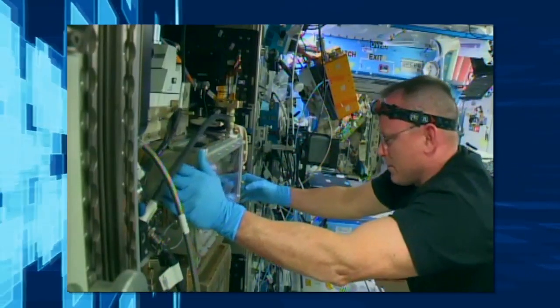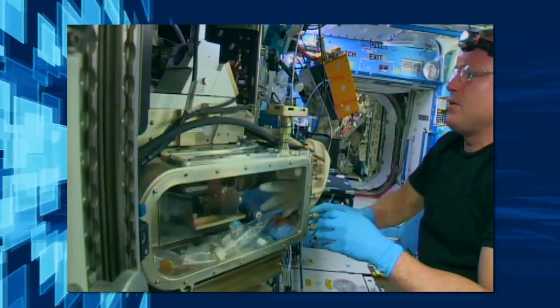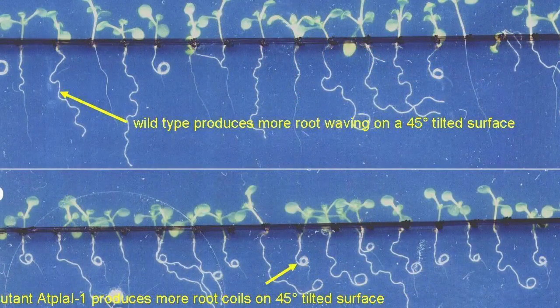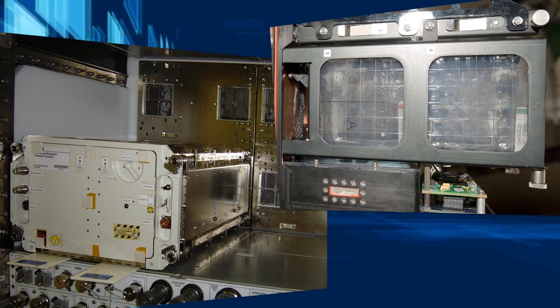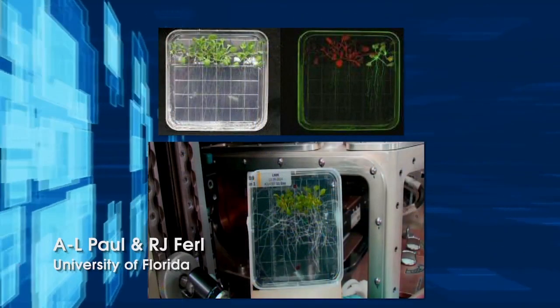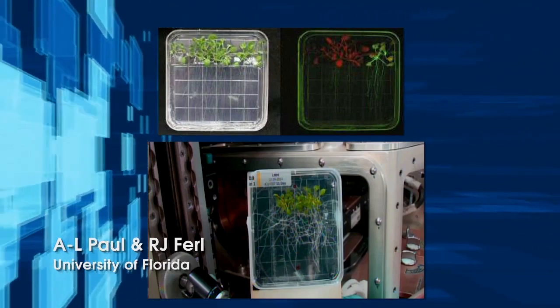We are using a new piece of hardware, the LMM, the Light Microscopy Module. In our first Apex experiment, we used the green fluorescent imaging system, the GIS, that's on orbit in the ABRS unit, to collect real-time images of the entire Petri plate that our plants are growing upon. That gave us fluorescent gene expression data as well as root growth data and such, which was great.